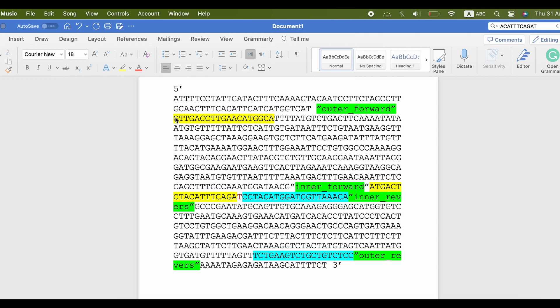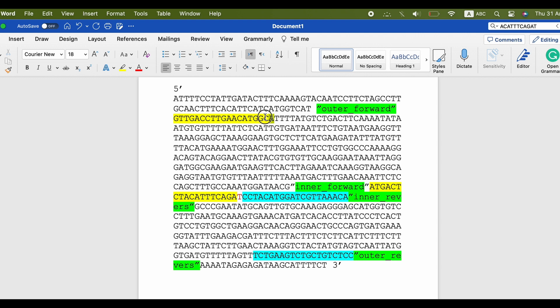Now it's time to choose the primers. Start with forward outer. Pick 18 to 24 nucleotides before the SNP of around 300 nucleotides, or as many as you want, and for the inner reverse primer, pick 18 to 24 nucleotides that contain the SNP at the tip of it, as you see.